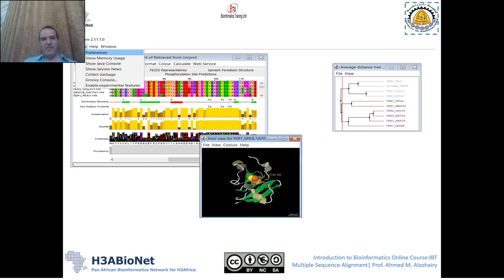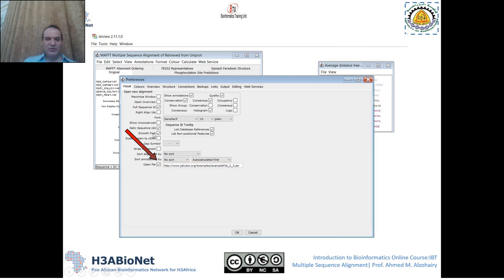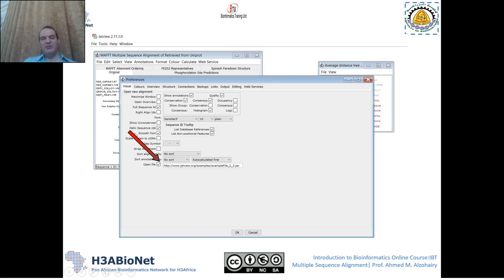If you would like to stop this example from opening every time, go to Tools, then Preferences, and uncheck the option called 'Open File.' This means when you open Jalview, the example will no longer appear. You can also enter your own file path here so that your own data file opens automatically every time you launch the program.